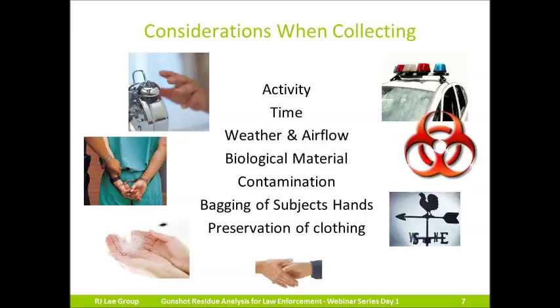Weather and airflow might affect the number of particles detected on a suspected shooter. When shooting incidents occur outside, wind, rain, snow, or humidity could also wash away particles or affect the amount of particles that are deposited, or land, on the shooter. Shooting incidents that occur inside can be affected by the movement of the air in the room.